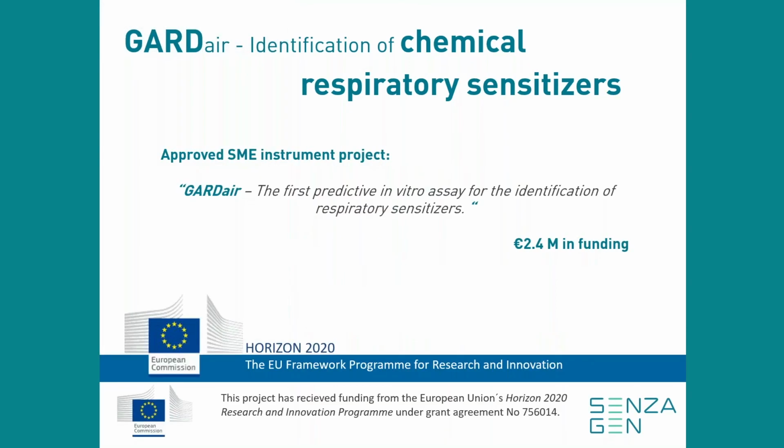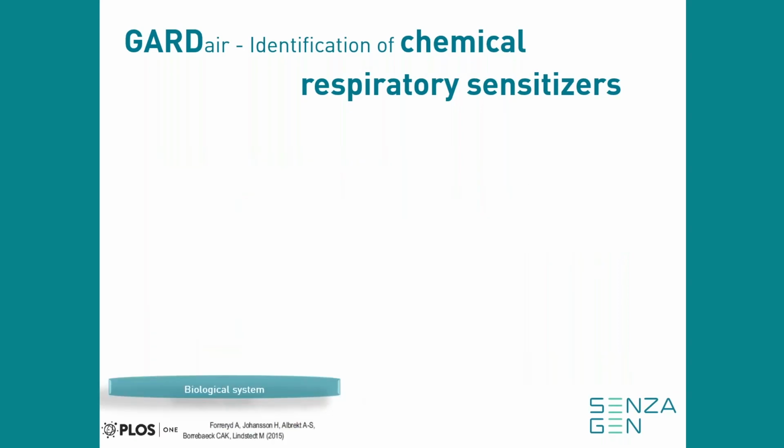So with the GARD air product that we have, for the identification of respiratory sensitization, we were fortunate enough to receive external funding in order to continue work with the development of this model and also to eventually bring this into an industrial application. We received a lot of funding from the Horizon 2020 project. And I would like to show you the results on how we have now developed this assay. As you start to recognize now as well, we use the same strategy.